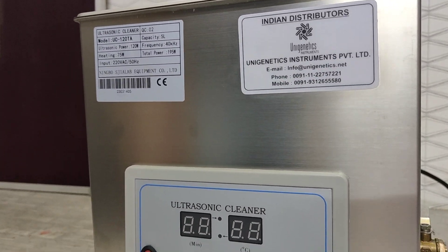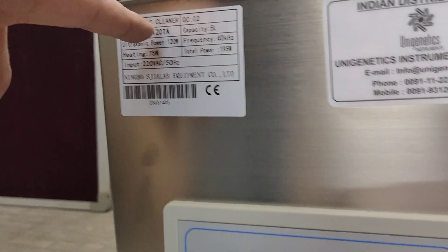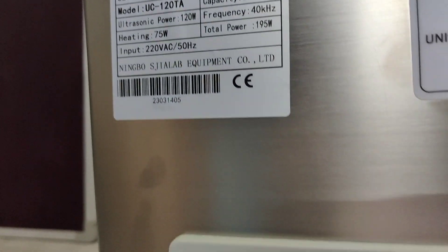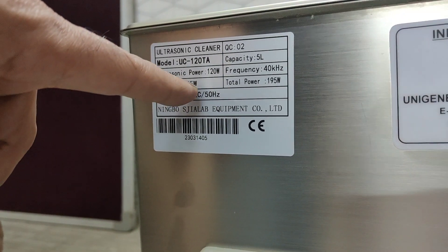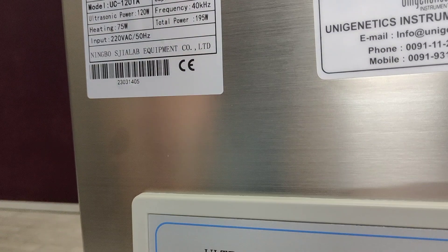This model is UC 120 TA. The capacity is 5 liters, ultrasonic power is 120 watts, and heating power is 75 watts, so total power is 195 watts.